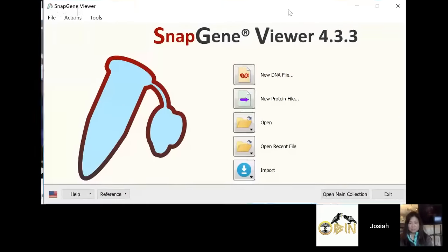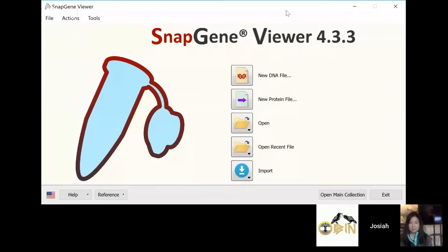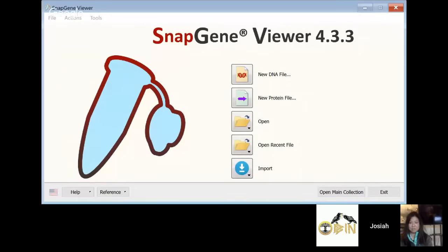So we're going to do SnapGene. If you haven't downloaded SnapGene, download it and install it right now. Download and install SnapGene. I'm going to share my screen, or share my program. All right. SnapGene visible? Yes. All right, great. Seems to be visible.